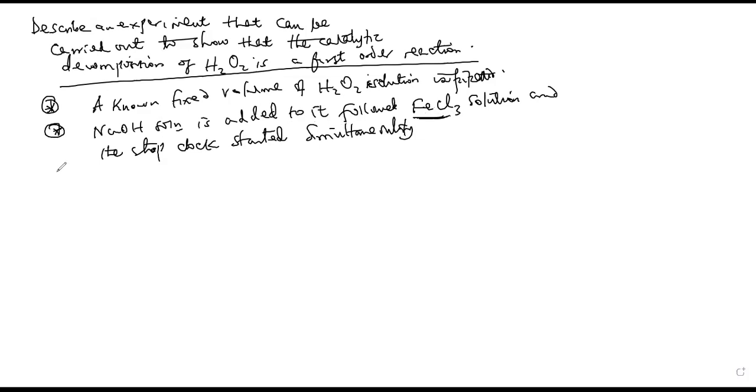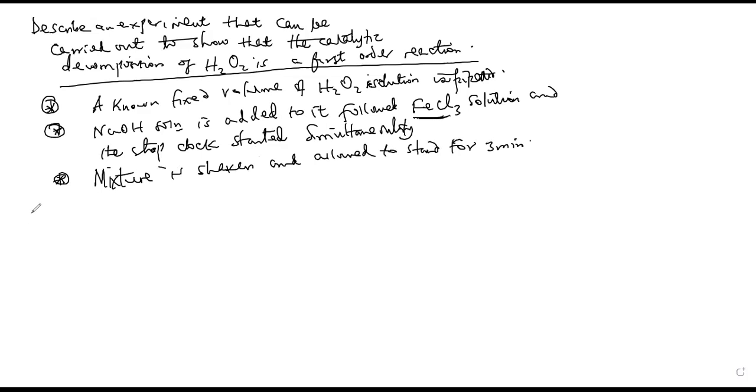Then the mixture is shaken and left to stand for 3 minutes.